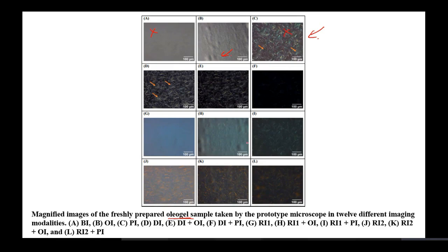And these crests are visible everywhere, over here also, and here also. And if you see the dark blue plus yellow color system and compare the results, you will find that it is giving a better result than the Rheinberg illumination we have used in this third row. Okay, so with this I conclude this microscopy lecture.